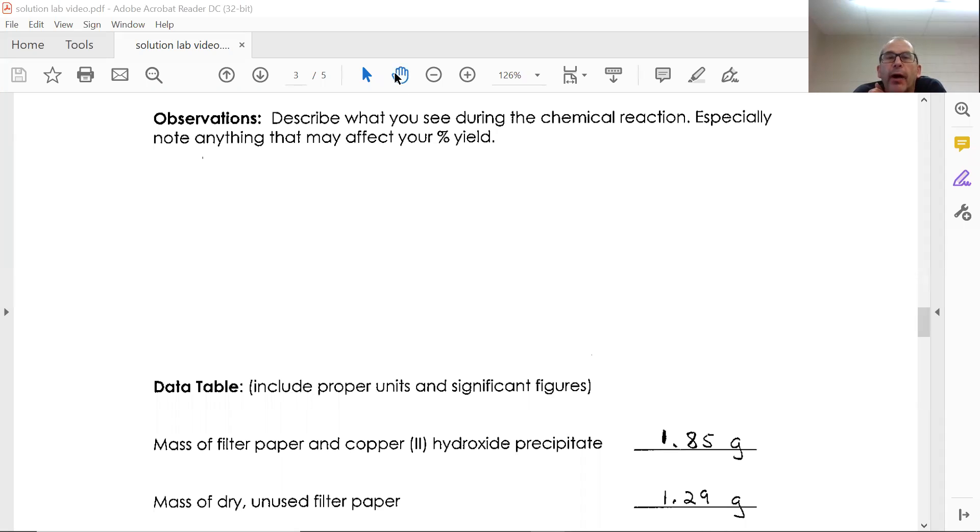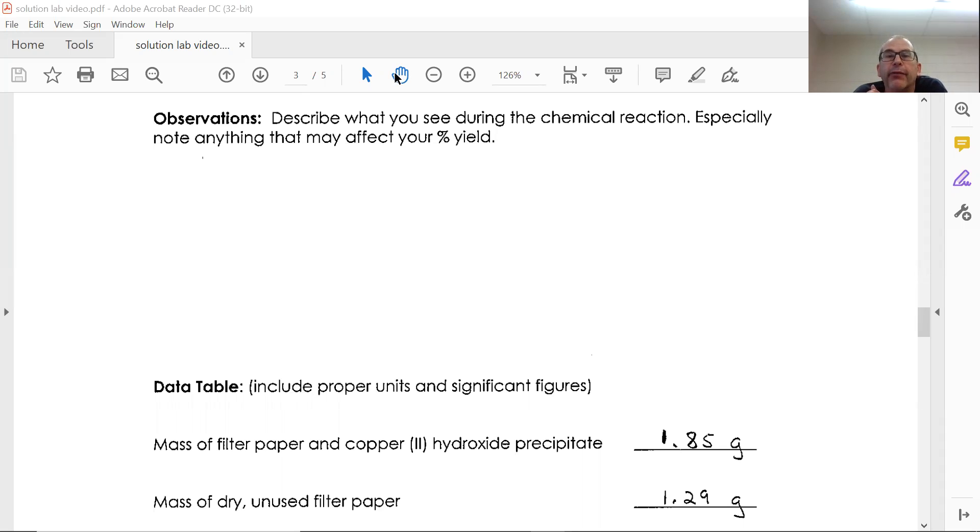Solutions Lab video three. We are going to look at the data and then the processing of that data from the data table.